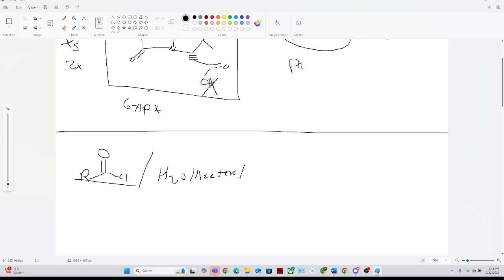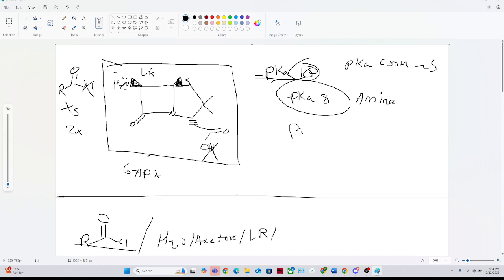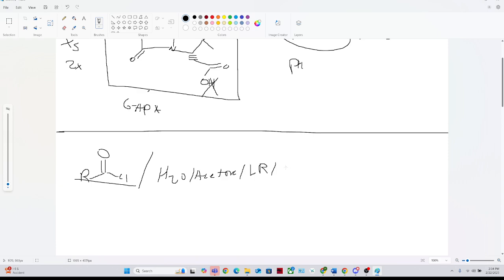And you're also going to have, assuming your reaction didn't go to absolute completion, which is typically the case, especially in a class like this where you're shorter on time, some limiting reagent. And you're going to have your product. And all your product is a more non-polar derivative of the 6-APA. Okay? But let's just say D6-APA for a derivative of 6-APA.